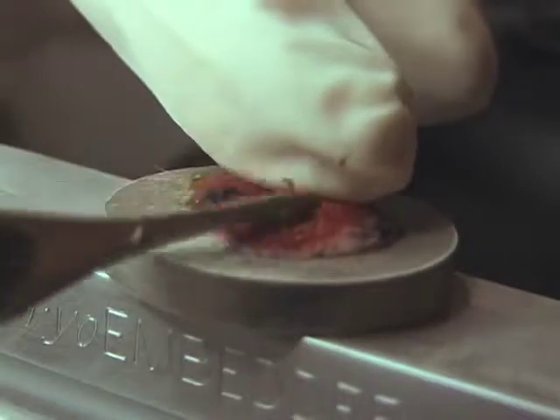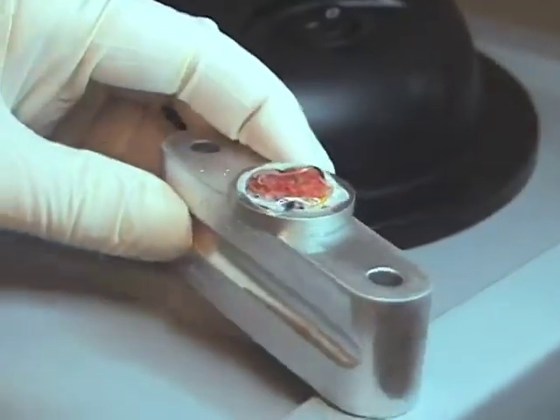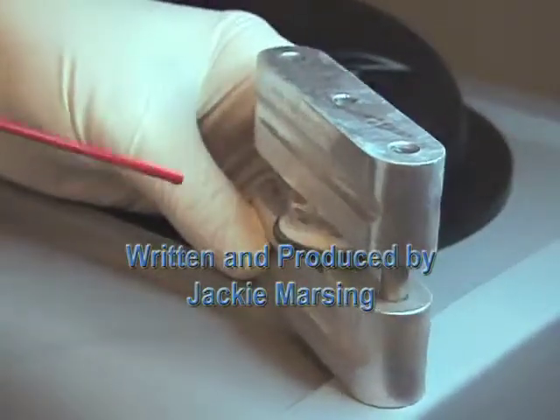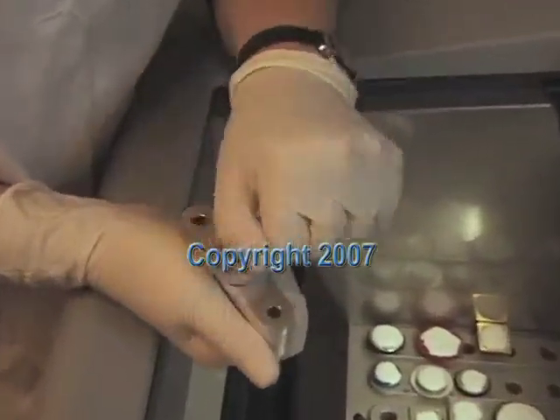Place the cutting chucks back into the holder and begin cutting this case. The cryo embedder system is easy, fast, efficient, accurate, cost-effective, and durable, and has been proven in labs and offices across this country and around the world to be a valuable instrument and tool in the processing of tissue for frozen sections. Simply said — it works.